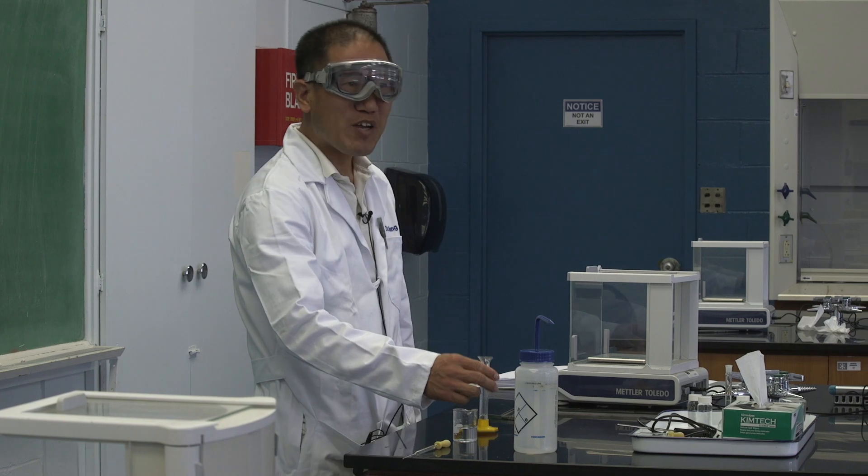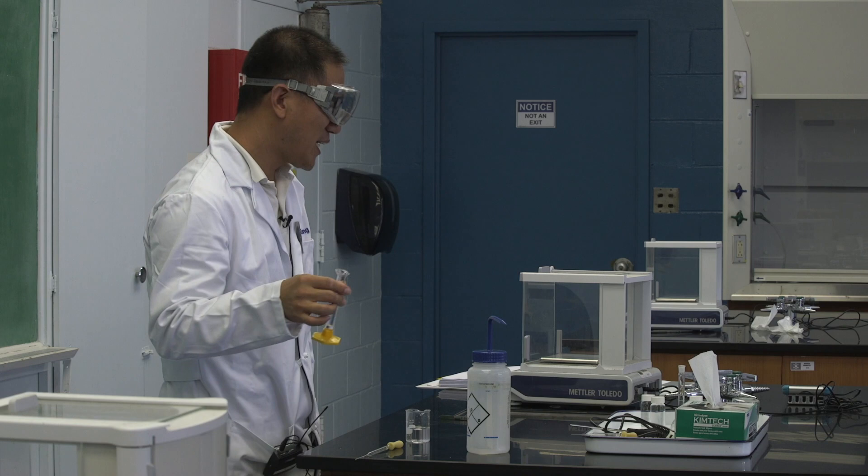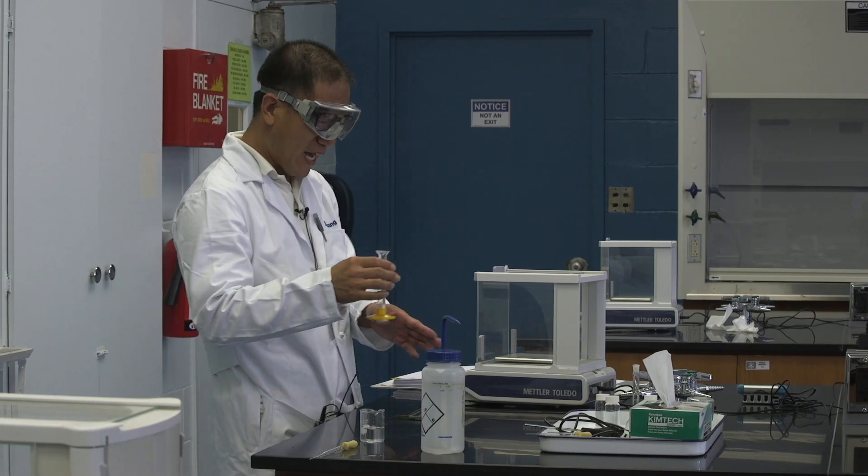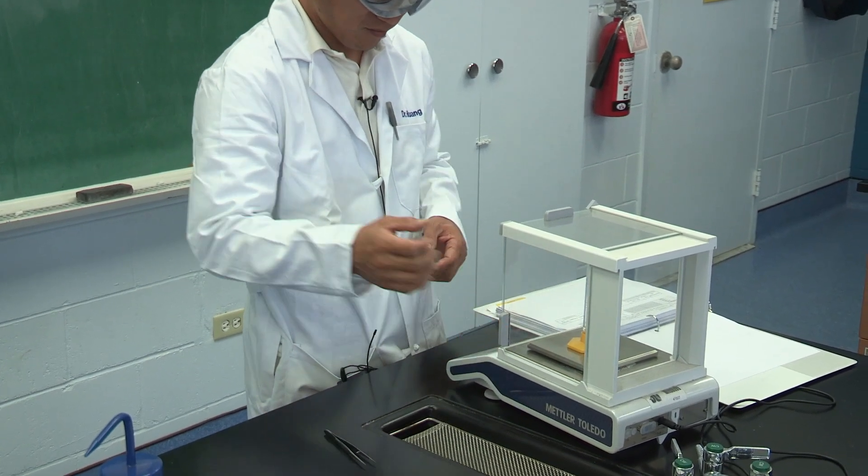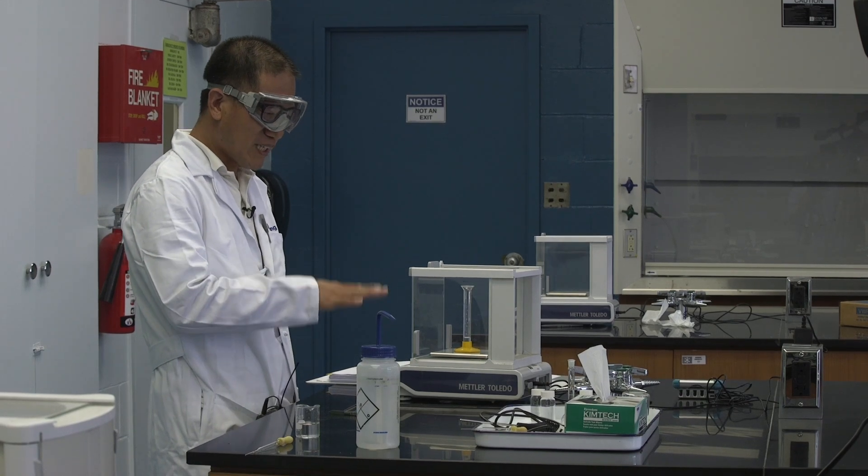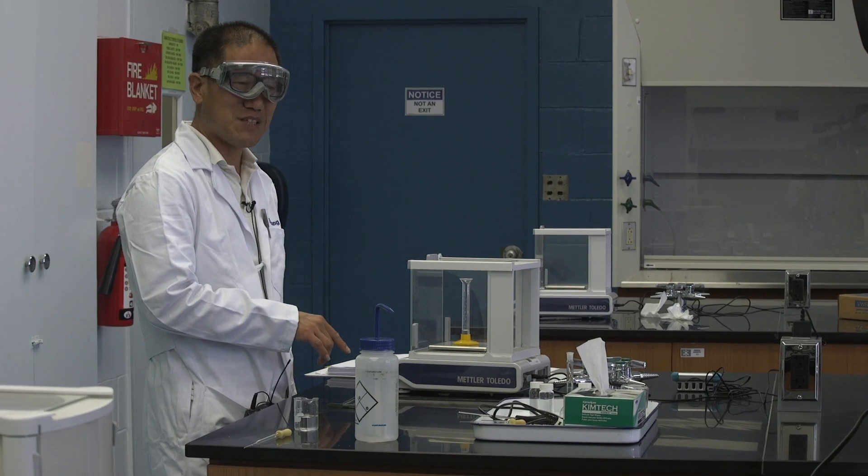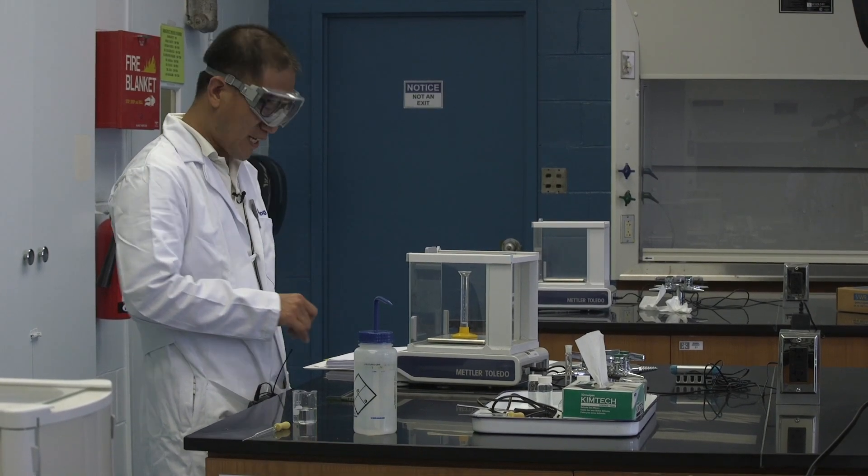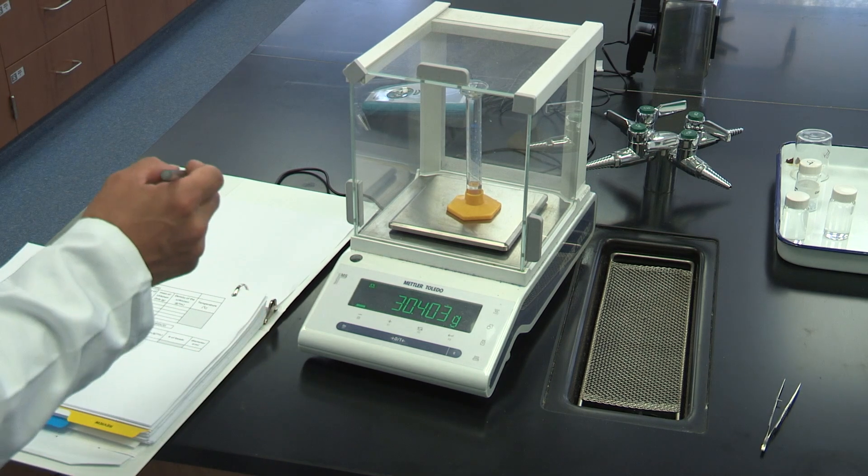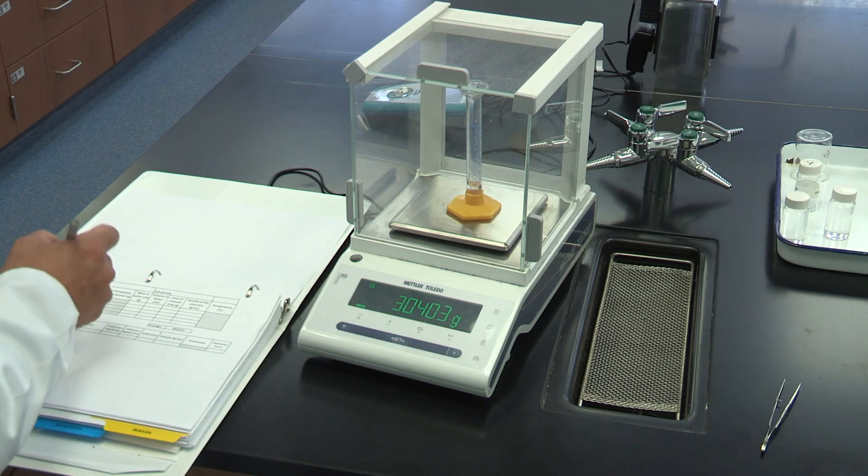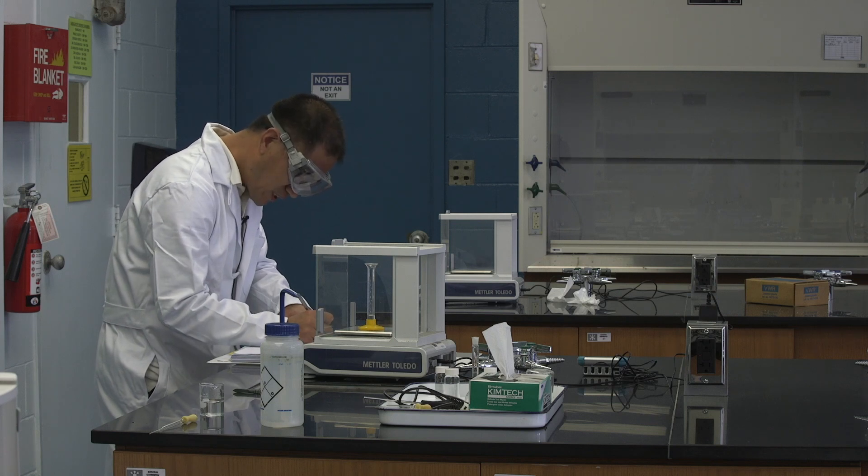And then the next step, we want to get the mass of the graduated cylinder with the water. Again, we use the electronic balance to do that. Make sure before you put the graduated cylinder on top of the balance, you have to make sure the reading was zero. If it's not, press the button in the center. And the reading is 30.403 grams. So let's put them in our notebook. 30.403.